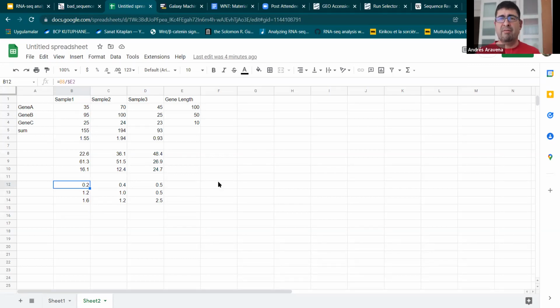You have a factor in the last row and a factor in the last column, and you are dividing by both things. So I think the order is not relevant in this formula.